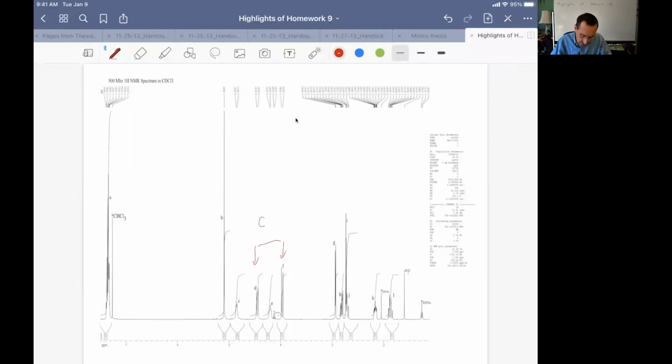So this is the methylene group C7HDHF. And you'll quickly find it's a methylene group. You'll quickly see it's isolated. You can see this little bit of an AB pattern where the two peaks are tenting into each other. And if you look at all of your other couplings in the molecule, like even this ethyl acetate impurity, you very quickly can calibrate your eye on what a typical J value is.